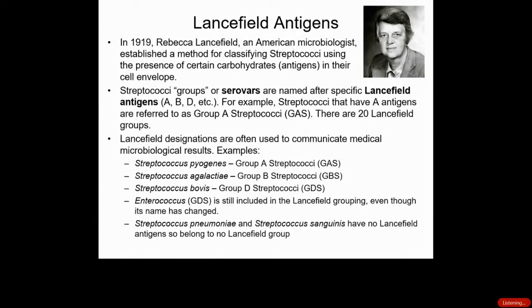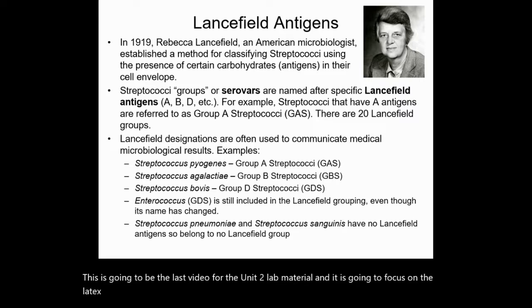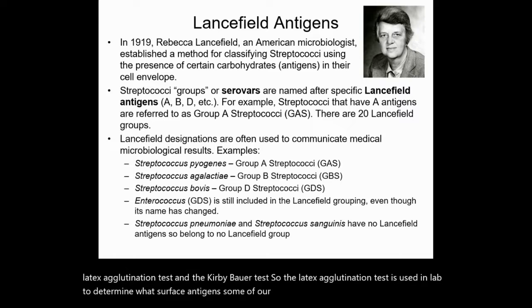This is going to be the last video for the Unit 2 lab material, and it is going to focus on the latex agglutination test and the Kirby Bauer test. So the latex agglutination test is used in lab to determine what surface antigens some of our streptococci have.